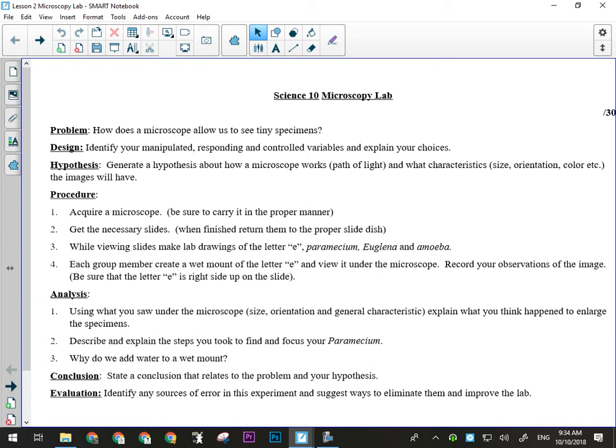Okay, controlled variables. The most important controlled variable is your technique. So I'm giving you one, technique. Essentially, you need to view all of the specimens in a similar way. That is, they're put under the microscope and you are looking at them with the scanning power lens, and then maybe not all of them, to low and to high power, depending on how big they are. You're getting them in focus, that kind of thing. So technique is obviously pretty important.